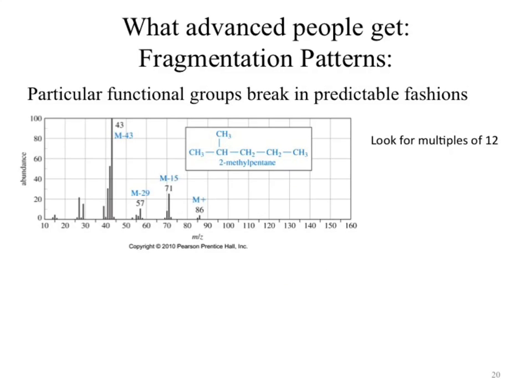So if we look at an actual mass spec, first thing we want to go through and do is identify our M plus peak, because that gets us the molecular weight of our compound. Where's the M plus peak? 86. So it's this tiny little peak right there. You'll notice that most commonly that number is provided to you so you don't have to read it off the chart. That also happens to be the tallest peak within 3 units. What do we mean by 3 units?